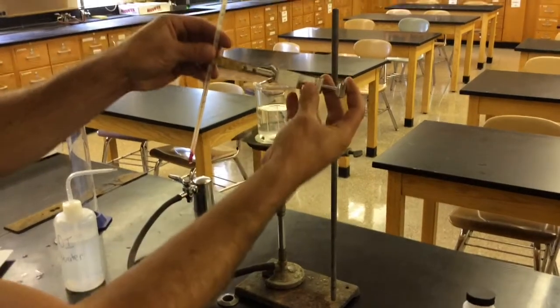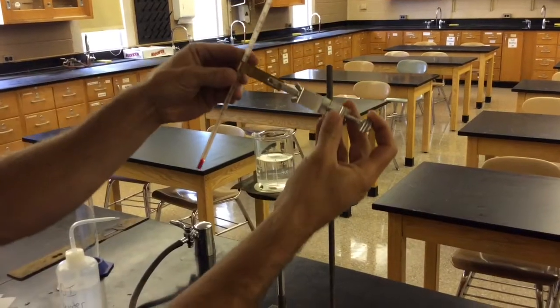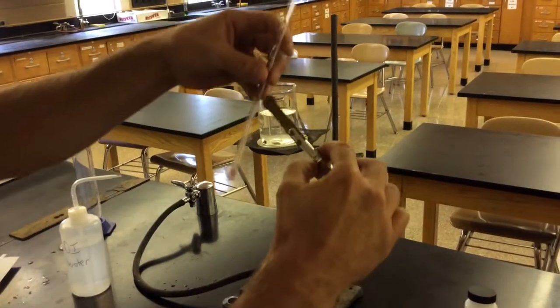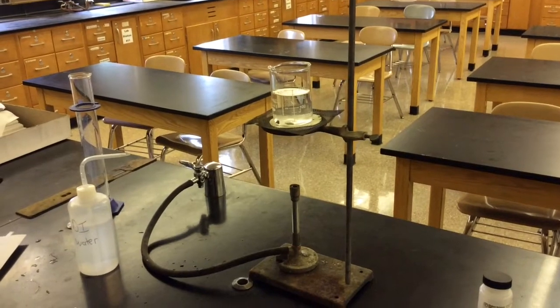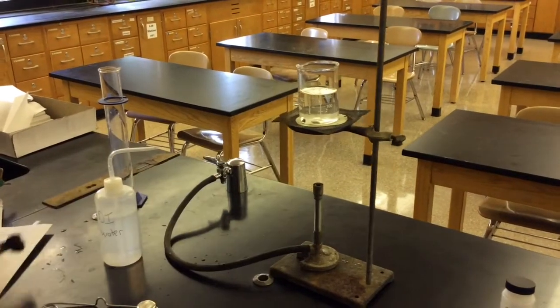We are going to need a thermometer. We have a 150 degree thermometer and a thermometer clamp. The thermometer clamp is a lot smaller than a test tube clamp, so don't use a test tube clamp. Use the thermometer clamp, and I'll show you a test tube clamp for comparison. A test tube clamp is something more like this size.